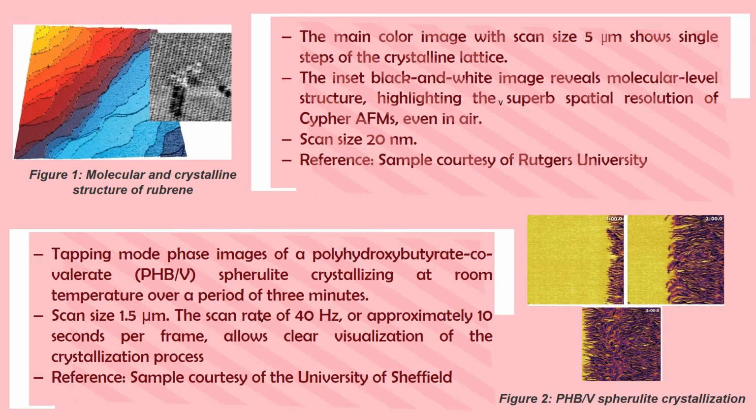The small area in contact between the tip and the sample is responsible for the high resolution. This, in turn, is achieved by using ultra-sharp tip probes in addition to the tapping mode, which results in very gentle sideways and vertical forces between the tip and the sample.